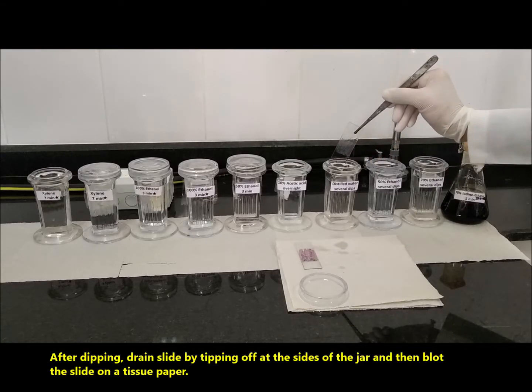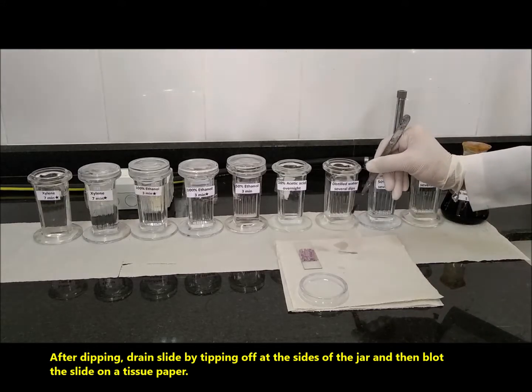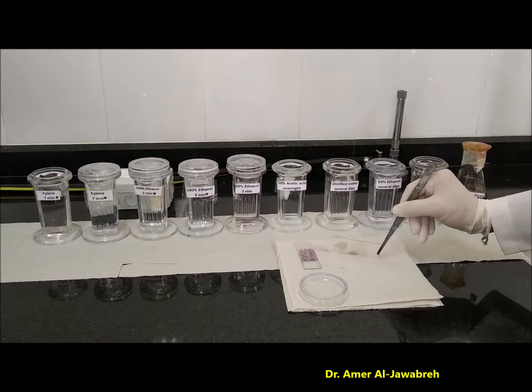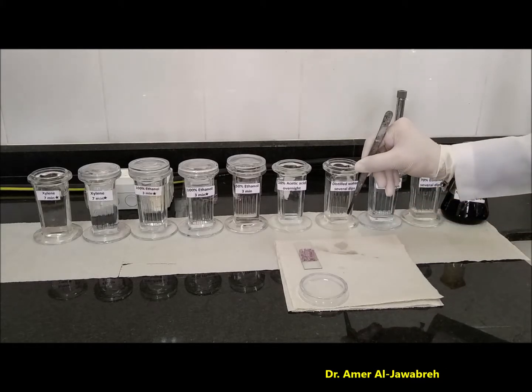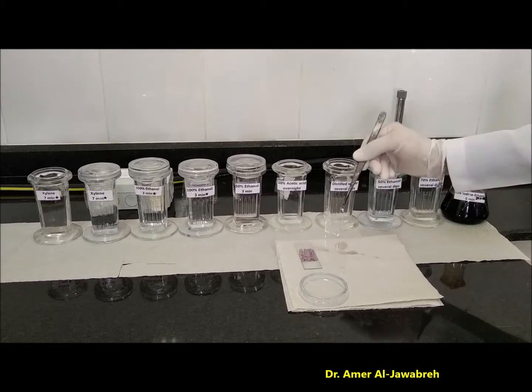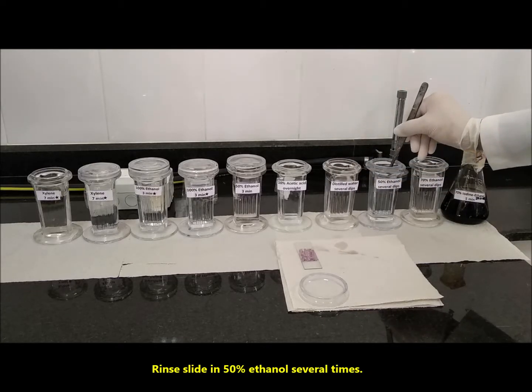After dipping, drain the slide by tipping off at the sides of the jar, and then blot the slide on a tissue paper. Rinse the slide in 50% ethanol several times.